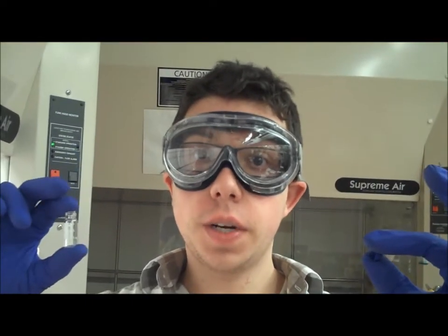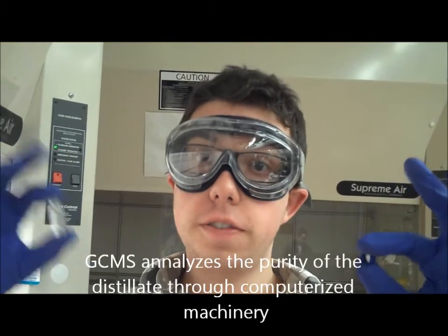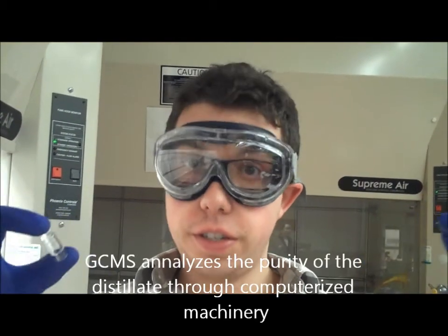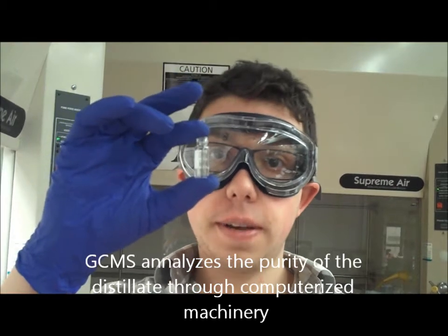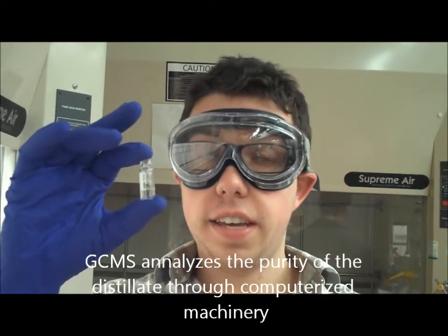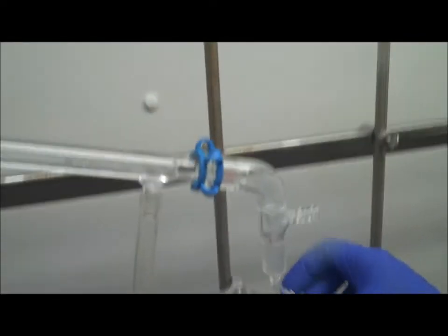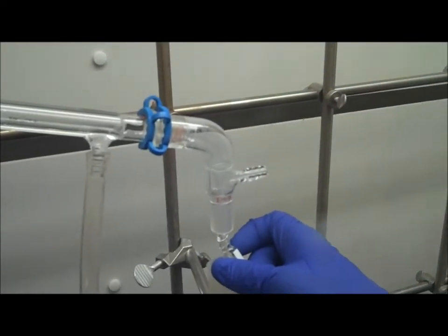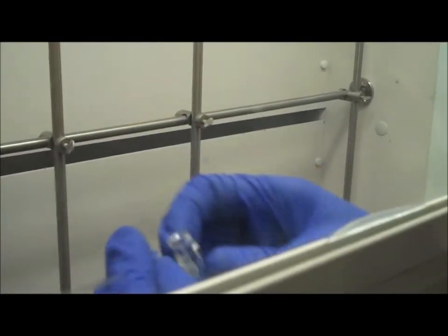Throughout the experiment, there are certain points where you want to take GCMS samples to find out how pure your product is. Here is a GCMS vial. A good place to take a GCMS sample is your first drop of distillate. To take a sample, place the vial under the condenser and collect about two or three drops.